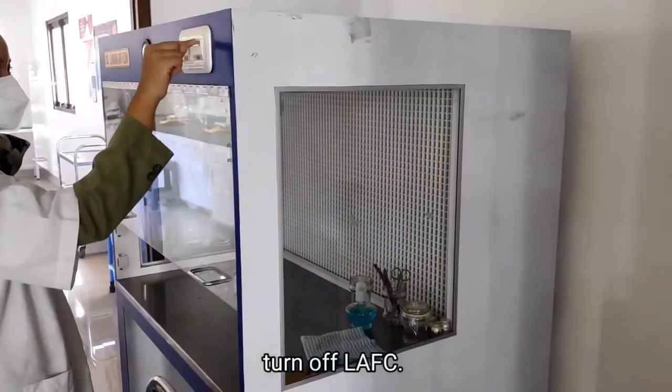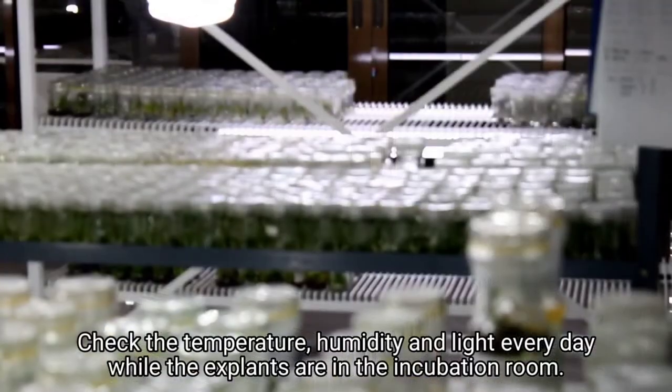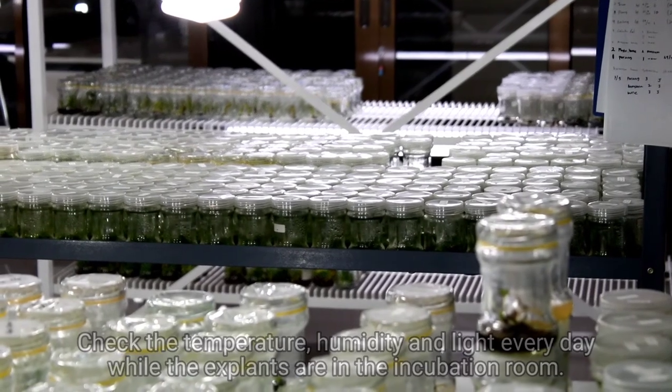Turn off LAFC. Check temperature, humidity, and light everyday while the plants are in the incubation room.